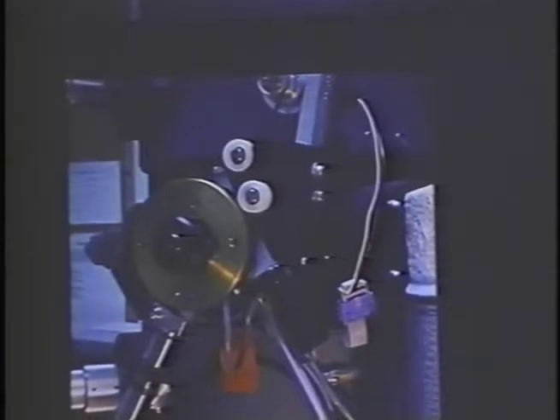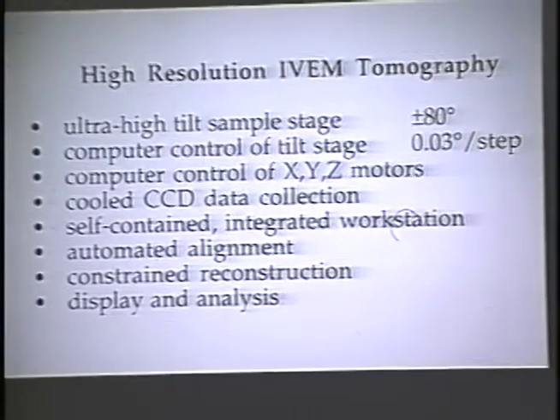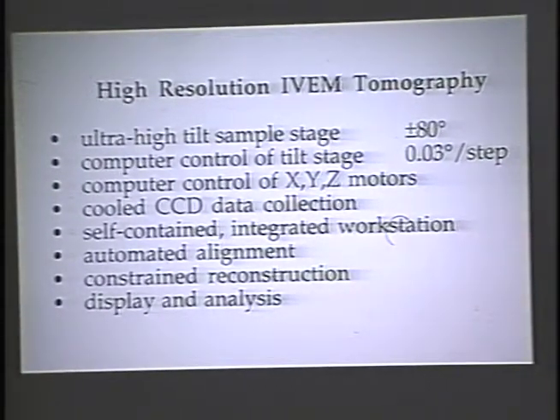And this is a Z drive to automatically change the Z height position. Okay. So all of this comes together to provide a very powerful integrated system for very rapidly collecting high-resolution tomographic data. What used to take us about a month and a half to end up with a data set, by doing it manually and developing films, now we can do in an afternoon. Okay? So, I mean, it's a stunning achievement in where we've gone.